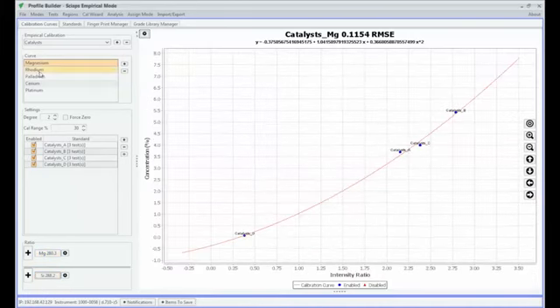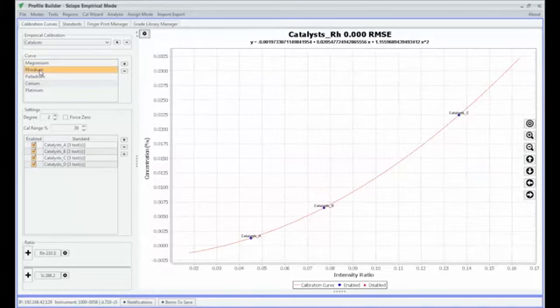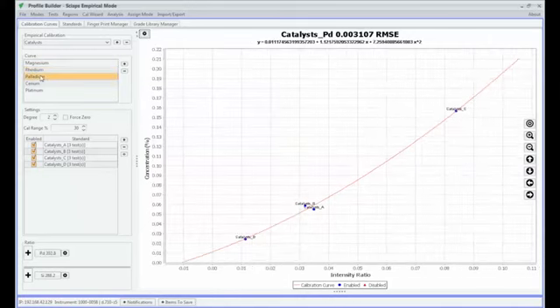So in this case, I've actually gone through and made some calibration curves for the other elements in this set of samples. We've got our rhodium curve. These samples have rhodium up at about 225 ppm and lower. We've got palladium. Here is our palladium calibration curve.